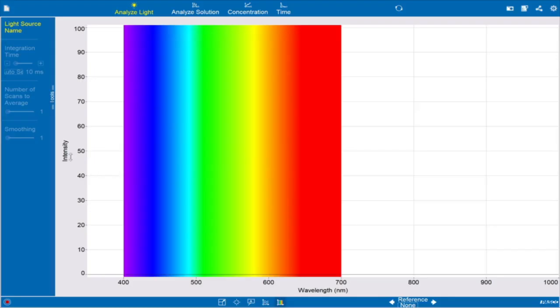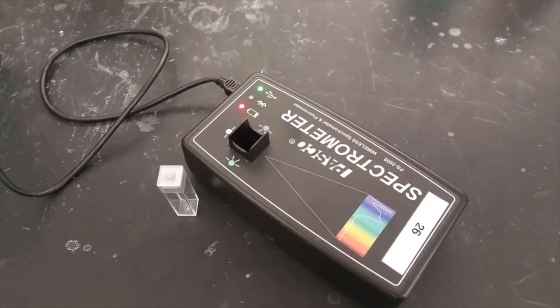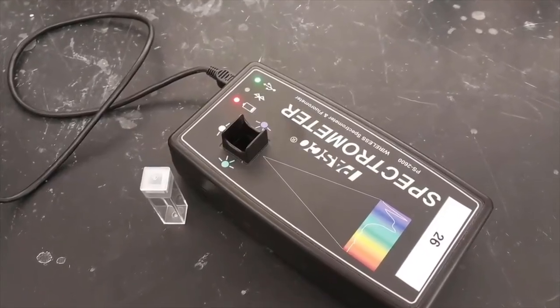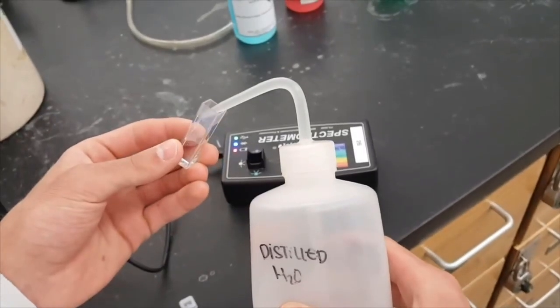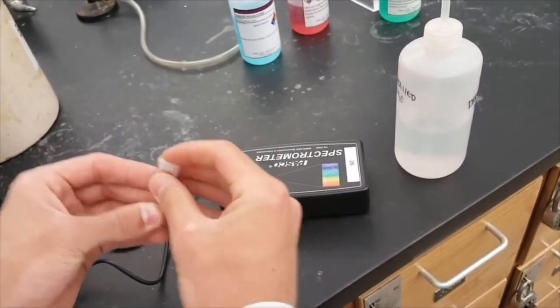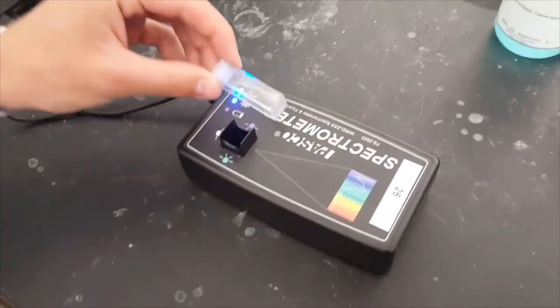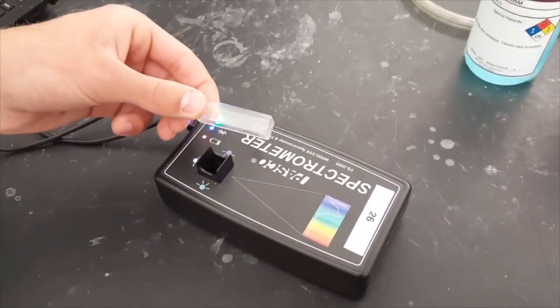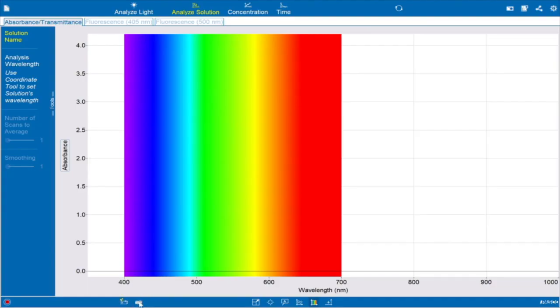To begin, calibrate the spectrometer. Click on Analyze Solution at the top of the spectrometry program. On the bottom left side of your screen, locate the button that says Calibrate Dark when you hover over it — it looks like a dark spectrometer. Before you click, make sure that your spectrometer is completely empty with no cuvettes inside. Click on the Calibrate Dark button and wait a moment as the spectrometer calibrates. Next, fill a cuvette with deionized water and put it into the spectrometer. Make sure the cuvette is aligned properly with the transparent side facing the light source, indicated by the white light symbol on top of the spectrometer. Once ready, click on the button that says Calibrate Reference. Make sure both calibration icons have a green checkmark before you continue.